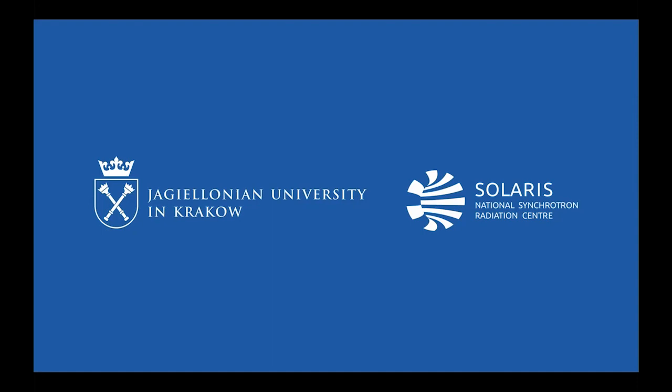And probably the main goal of this first part of the talk is to encourage you to plan your experiments on your ARPES beamline and to assure you that even the not experienced user won't be left alone with his data. And in the second part, if I have enough time, I will show you a very brief tutorial for IGOR Pro software. In fact, I'm going to show the workings of one of the commands, but probably one of the most useful and most important ones.